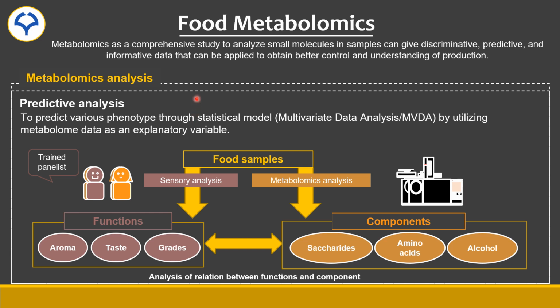Therefore, food metabolomics in Fukusaki Laboratory focuses on analyzing small molecules such as amino acids, sugars, and organic acids to understand more about the food control and production, and therefore can give discriminative, predictive, and informative data.